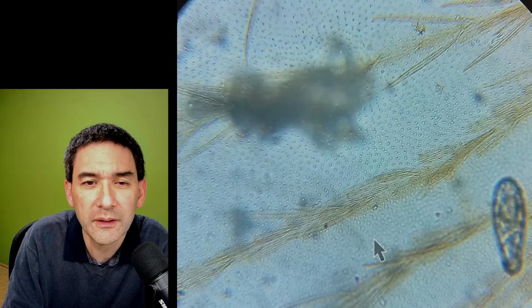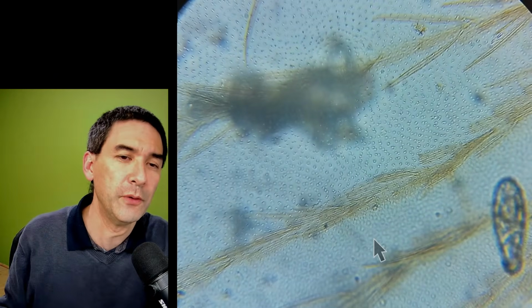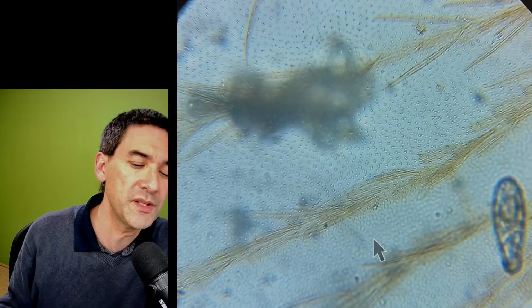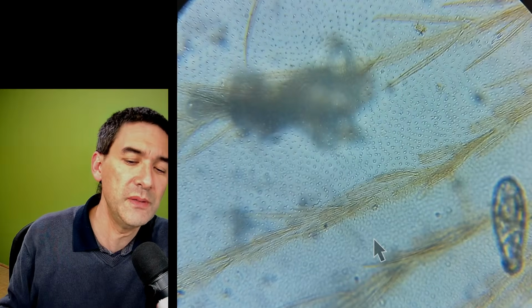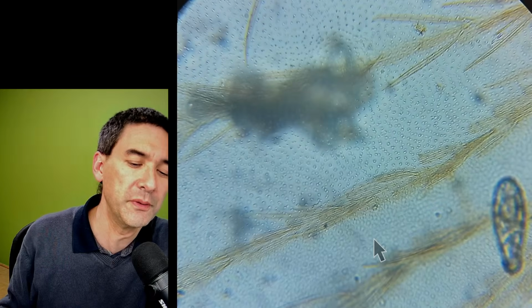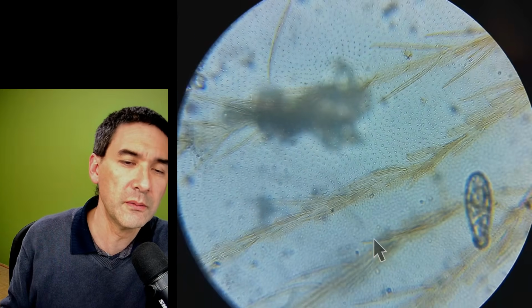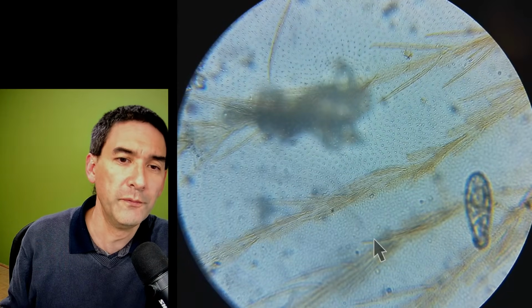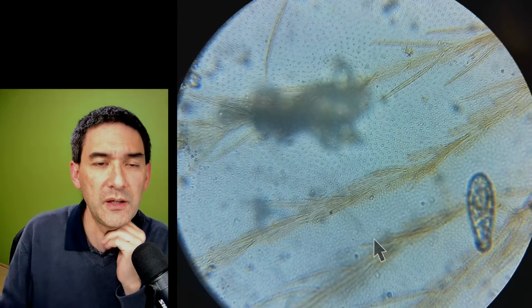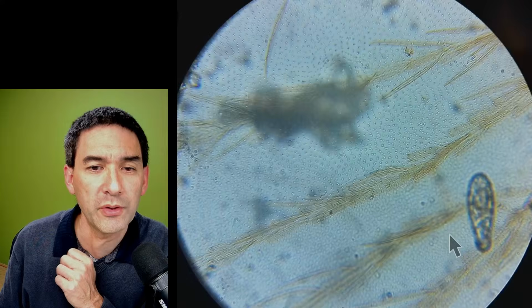Yeah. So you see a little bit also the problem that we have with those mobile phones, that they have a mind of their own in the sense that they want to focus, yeah, and so that means you have to always make sure that you can somehow manually stop the focusing. Let me quickly look, yeah. So that's the full field of view. And generally, when you have a camera set up using a USB camera, very often you only take a picture of the central part here.